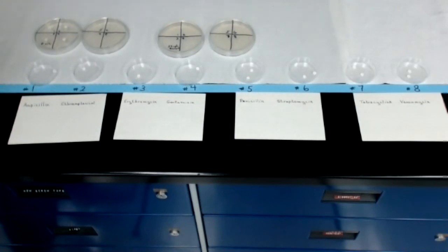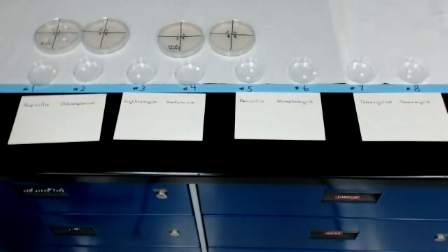So over the years, microbiologists have developed tables that indicate the minimum diameter of the zone of inhibition necessary to identify a bacterium as sensitive to the antibiotic.